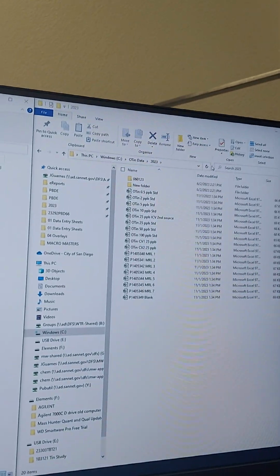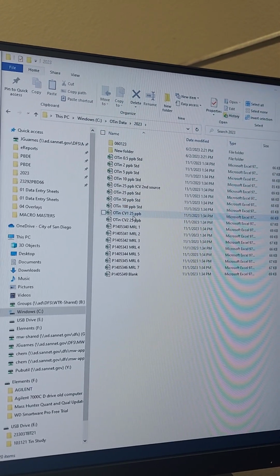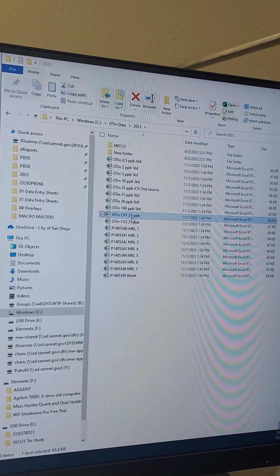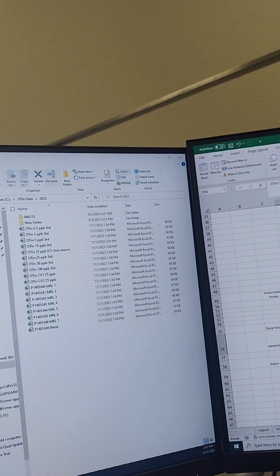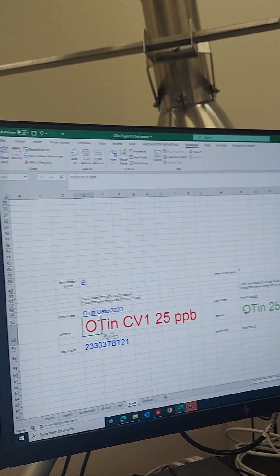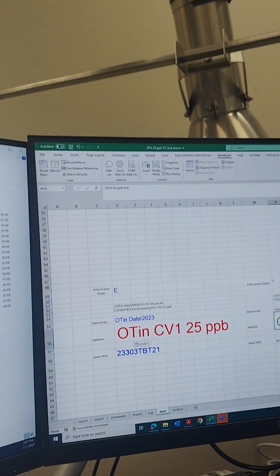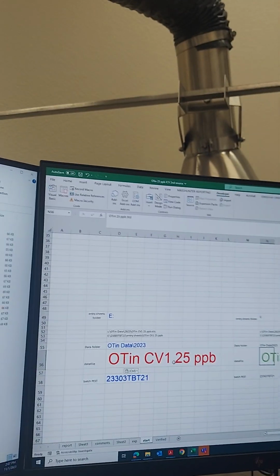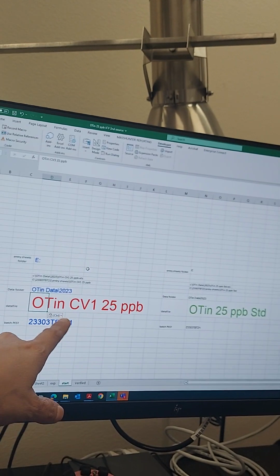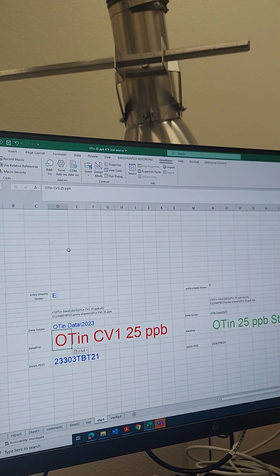Yeah. So now I'm gonna do the next sample, which was CV1 ocean? Yeah, CV1. And then this stays the same for CVs. So you understand which sample this should be, right? Yeah, it's the same in the office. It also copies the most recent CV. Yeah. Okay. But it's compared with the last CV in office. Okay. So let's try it again.